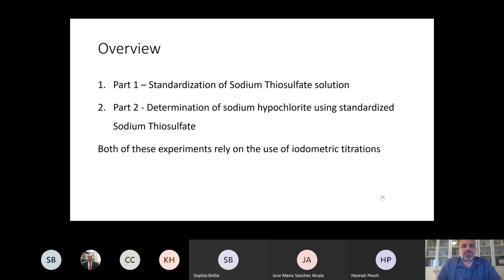They're not exactly titration-based experiments, but they're similar in that you're getting a dose response curve. You add a little more concentration and look for the response in the assay. But the solutions they use are all standardized beforehand, so they do standardization curves, similar to this.